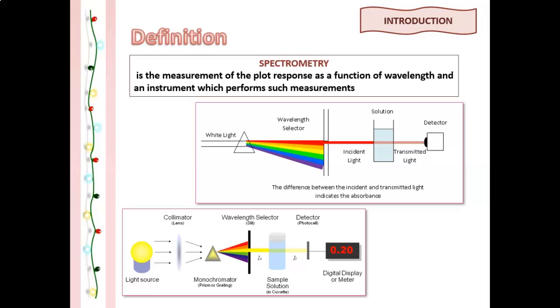Electromagnetic radiation, such as visible light, is commonly treated as a wave phenomenon characterized by wavelength or frequency, as I mentioned earlier. The light will then pass through this separated, and we call it the incident light with a single wavelength, and then transmitted through the solution, which is absorbed by the solution and will be detected as a reading or the graph that should appear at the detector.